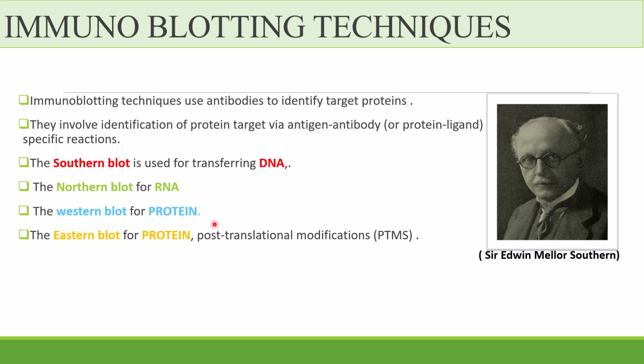Most of the time people will ask you about this, and in certain exams too, whichever you are preparing for, it might be GPAT, NIPER, anything. It's very basic, you should learn it. Keep it at your fingertips. S for Southern blot, S for south, S for DNA. Why DNA? D for DNA. In Hindi, DNA is associated with Dakshin, south. So you can relate like that. Northern blot is RNA, Western blot is protein.